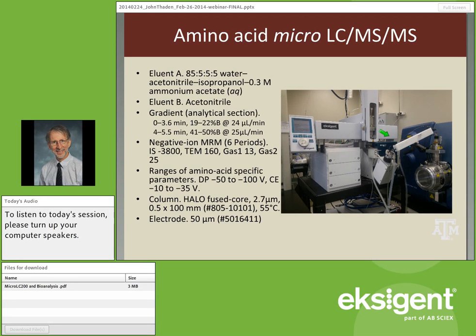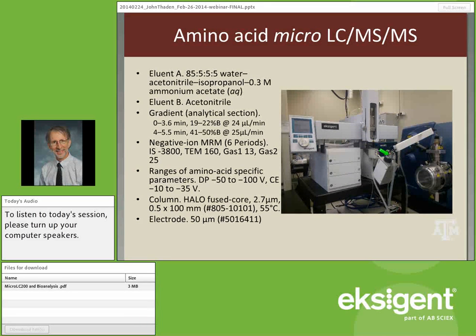Going through the system: the CTC autosampler comes with the unit; the cool stack keeps samples at your preferred temperature. A manual controller is supplemented by computer control. The robot needle and wash station are visible. A special microvalve allows very small system void volume, enabling injections of very small amounts directly into the column inside the oven, which then leads directly into the electrospray source.